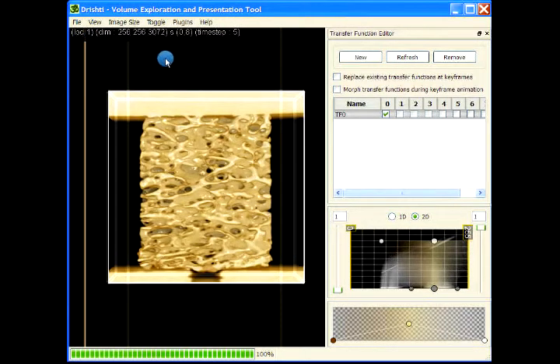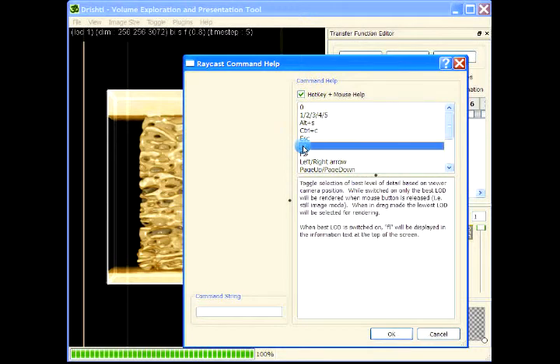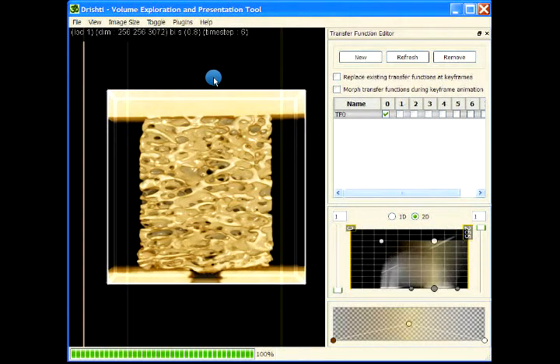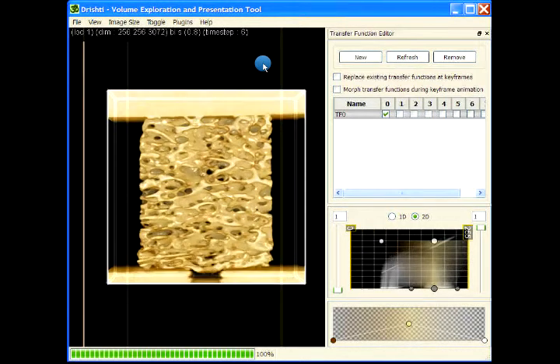Now if I don't want to progressively render from the lowest level of detail to highest, as it does when I change something, I can press F1, so it will take the best level. So spacebar again. F1 will basically give you the best level of detail from the camera position. Now if you press Z, it will always take the best level, and you can also see the time step. I am pressing Z and Shift+Z.